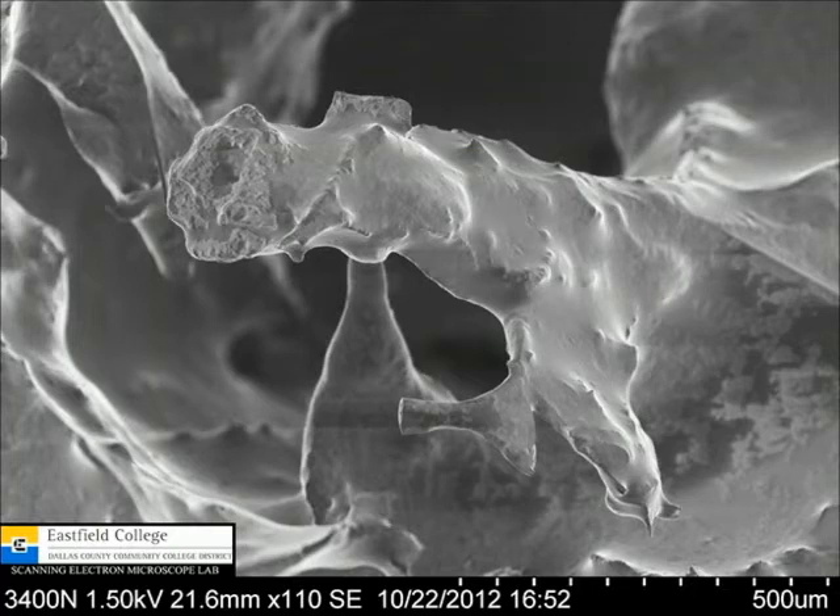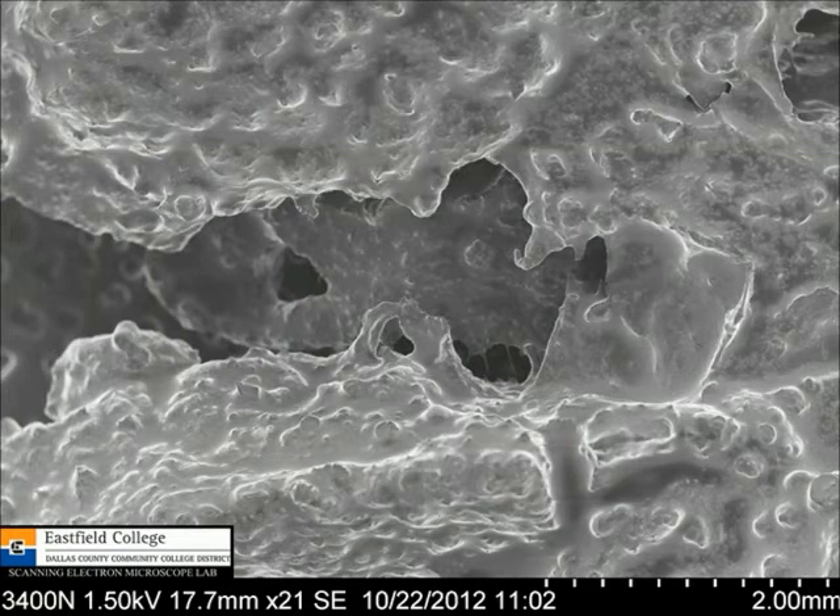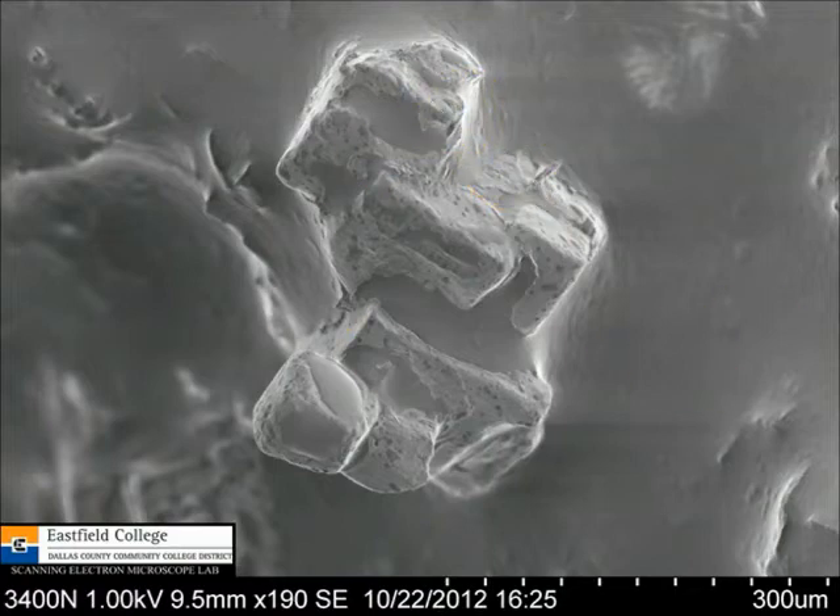So now let's look at the tater tots under the scanning electron microscope. I was a little bit surprised — I really didn't expect to see much here. But when you're offered a chance to see a landscape in batter, you find some really weird things. This is some batter on a tater tot, actually magnified 110 times. It looks like some sort of mysterious cave. This is the surface of a tater tot at only 21 times magnification. And of course, what would a tater tot be without salt? There's your salt right there, and we can actually get a close-up view of some salt crystals actually embedded in the batter.